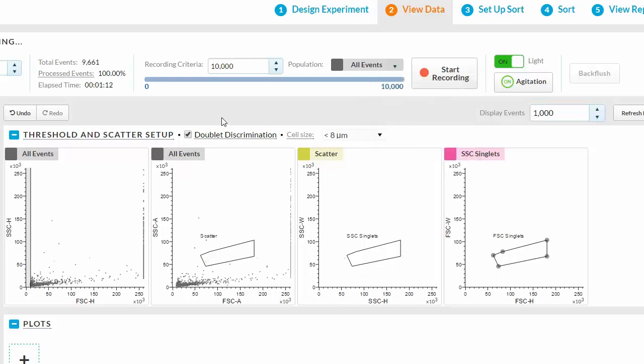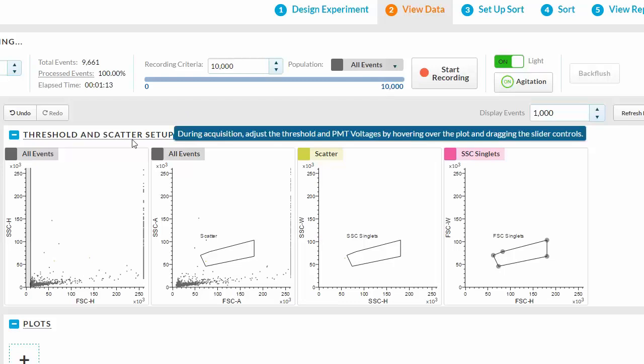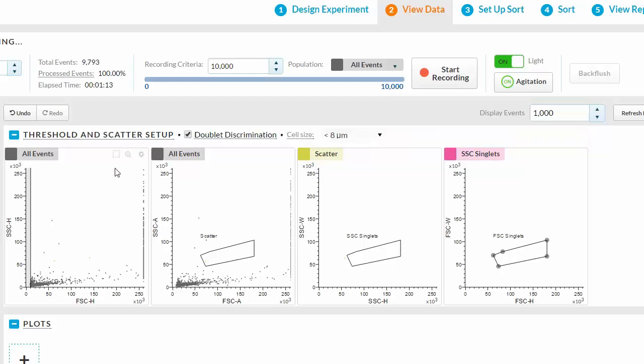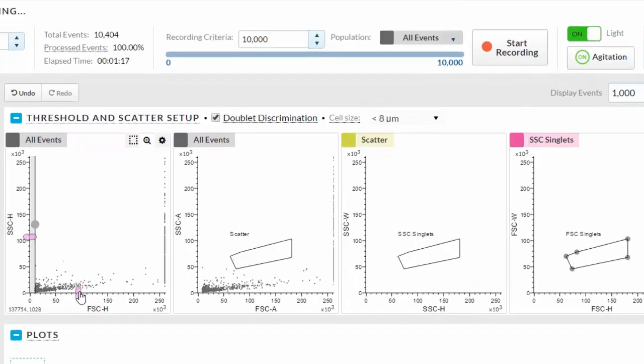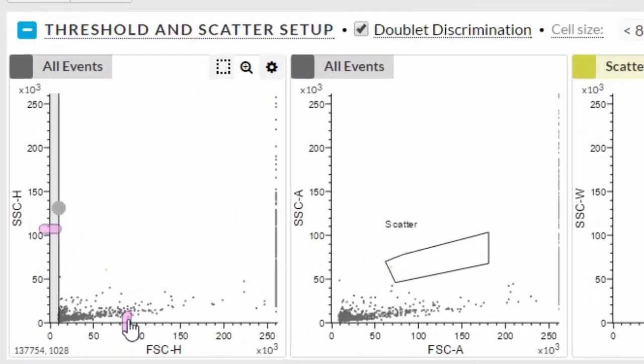The next section allows you to make live adjustments to both threshold and PMT voltages by hovering over the plot and dragging the slider controls. There are four forward versus side scatter plots with pre-drawn gates. The default displays are all events, scatter, and side scatter singlets. Hover over the first default plot to make the slider appear.